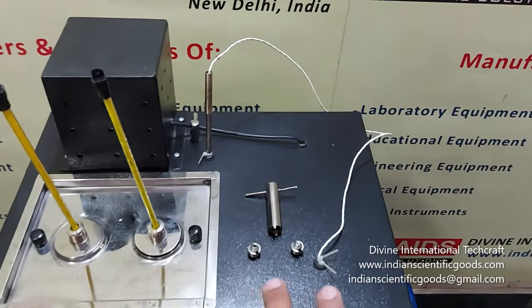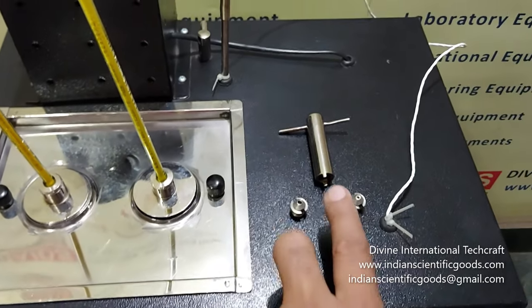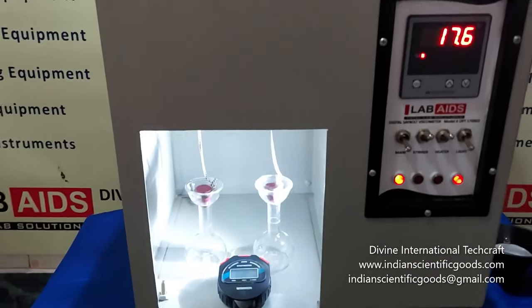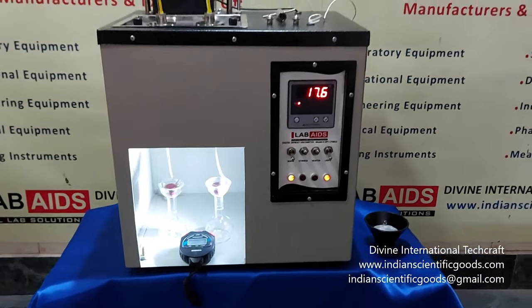Two jets — one universal and one furol — can be screwed at the bottom of the cups using the key provided. Glare-free fluorescent backlighting is provided for easy viewing of the test samples.